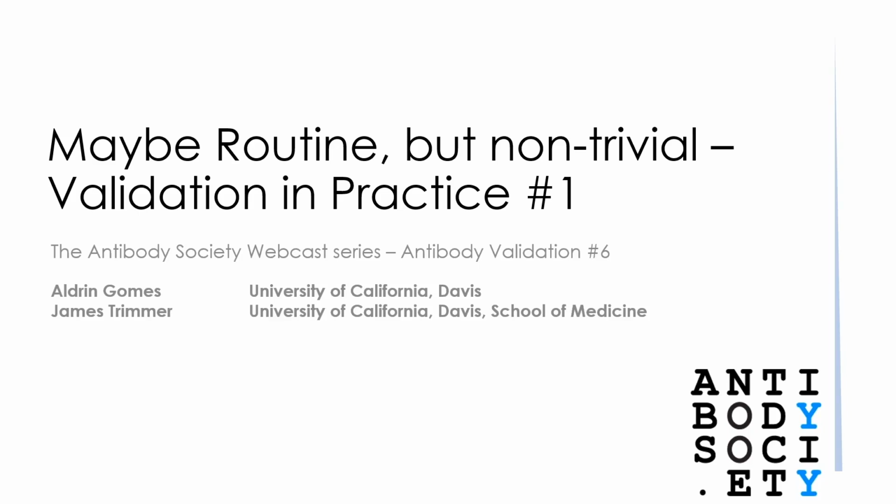I think one of the keys is to very carefully read method sections of papers and also interrogate as much as possible either the data sheets or the technical support from antibody developers and really try to get at a very granular level the details of the methods that are used so that you can reproduce those methods in your own lab or even be aware when you intentionally decide not to reproduce those and use a different approach so that you have some idea of what may be the consequences of doing that.